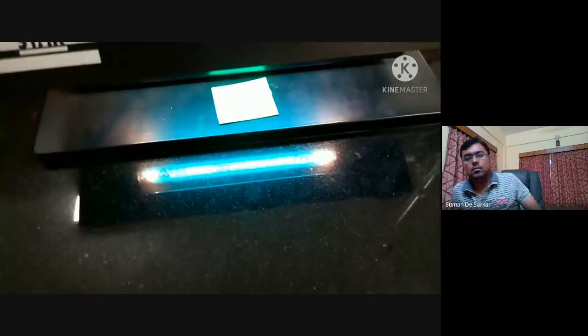Now we took that product, it's quite pure, and we have done the other spectroscopy analysis.